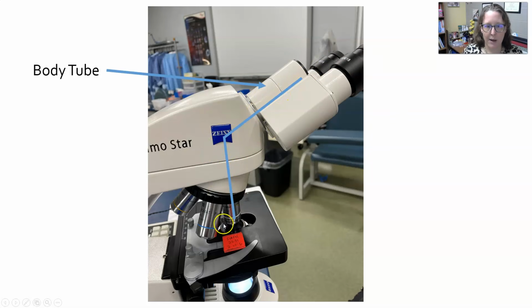And so the fact that you have this flip with the mirror is relevant in the use, because what you're seeing is really a mirror image. When you move the slide to the right, your field of view moves to the left. And if you move it up, it moves down.